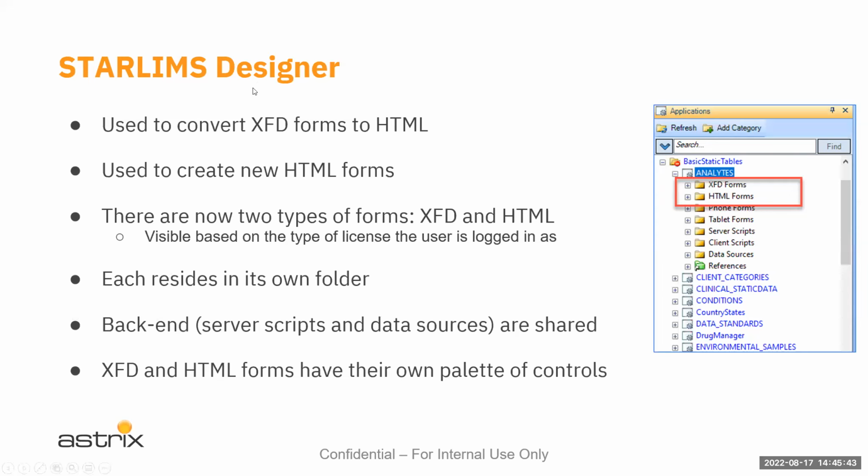Okay, so then inside the designer, currently there's both of them, right? So the whole system is there represented twice, XFD and HTML. But again, we're mostly focusing on HTML. XFD is just there as legacy. They are there, but you do need a license for it, like I showed. And if not, you don't see them. Okay, and then they are separate, right?